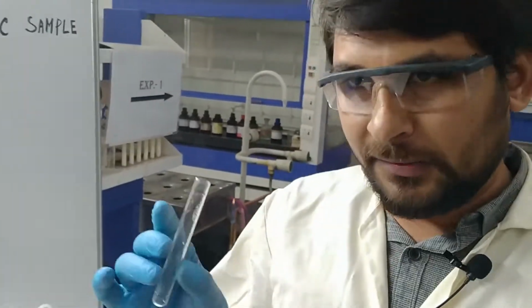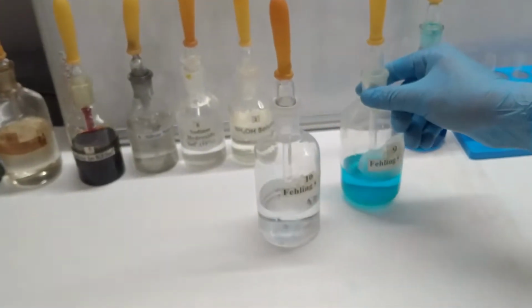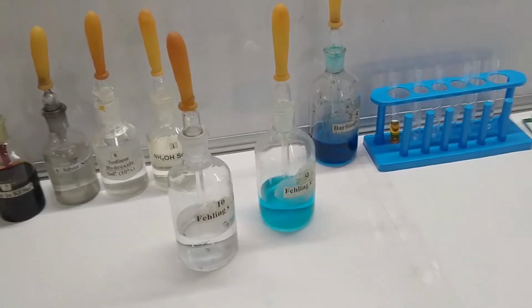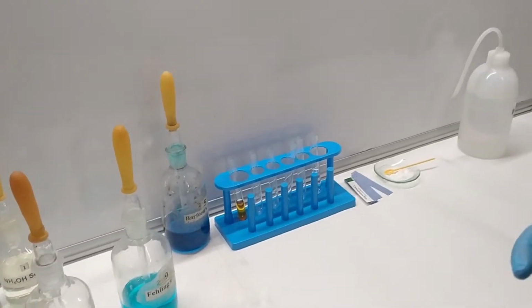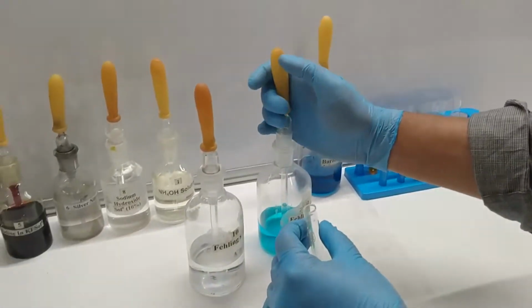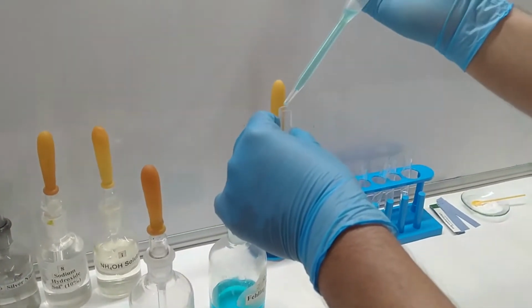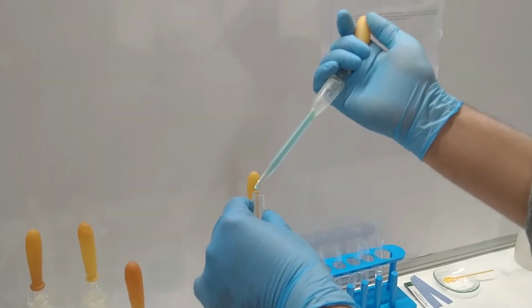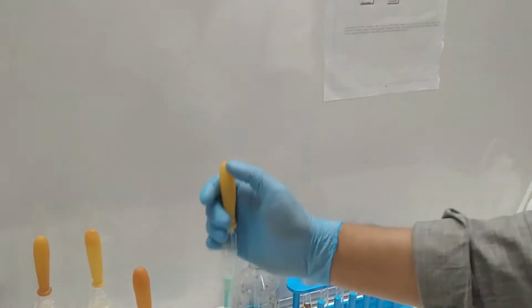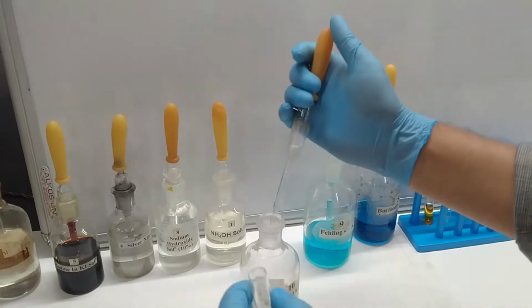For that we need a test tube. I take the test tube. So here you can find the reagents Fehling A and Fehling B. Okay, so I am going to add equal volume of Fehling A and Fehling B inside the test tube to prepare the Fehling reagent. So first of all I am going to take some drops. Suppose I added 5 drops of A, that means I have to add again 5 drops of B.